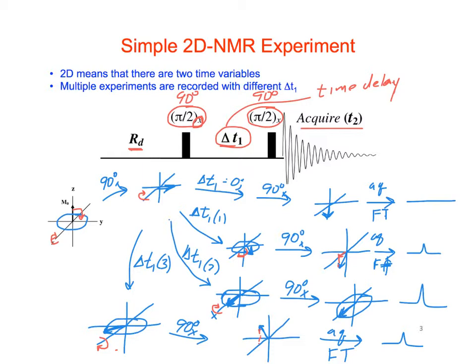Okay, if we went further around over into these quadrants over here, then we'd go smaller and we'd go through 0 then. And so the point is that we have an oscillating signal, right? The intensity here is going from 0 to positive to big to small.